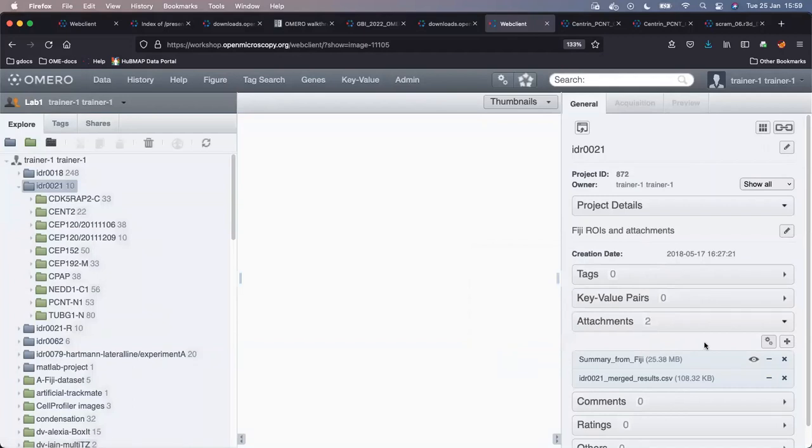Peter, can I just interject? Because there were a few questions in the chat of the behavior of the plugin.